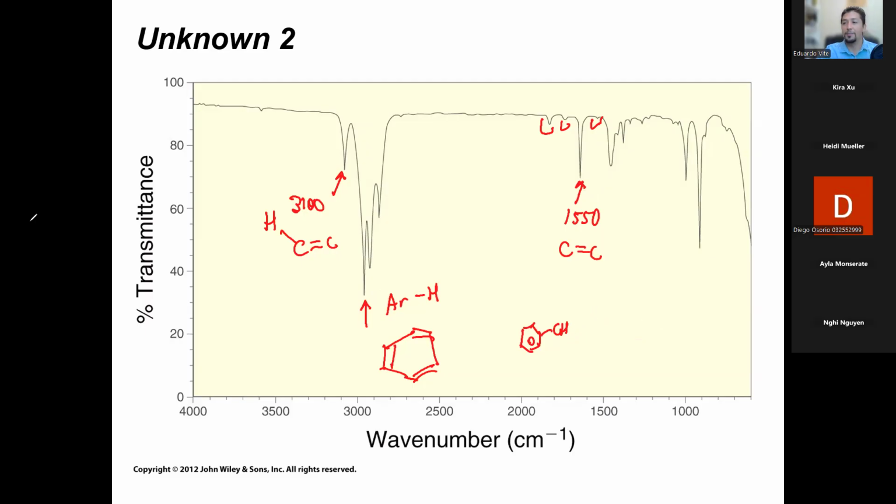So this is what I'm telling you. You need to know where your carbon-hydrogens are. Just because you don't see any other functional groups doesn't mean they're useless. They could still give you some information. Sometimes you'll see the standard stalactites and you'll say, well, it looks like there's nothing here, this just has to be a plain old boring alkane. That's all it can be, if that's what your mind tells you. Any questions about this one? These are a bit trickier, but you can still see based on the lack of other signals. If you don't know the other signals, you cannot make assumptions about just a hydrocarbon.